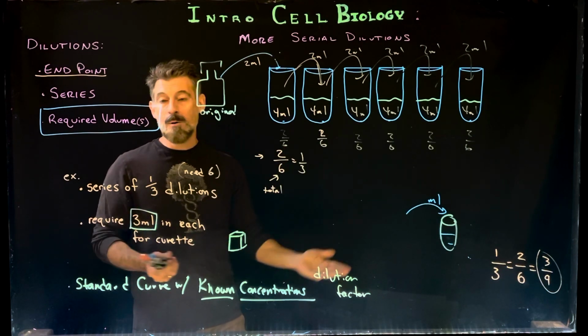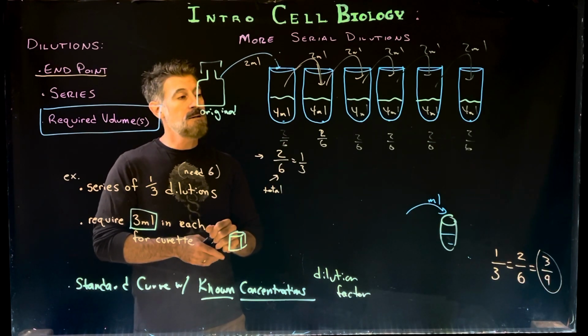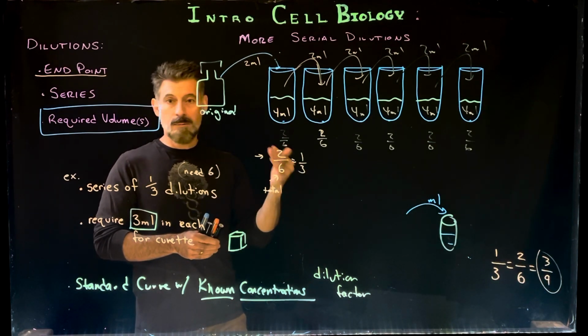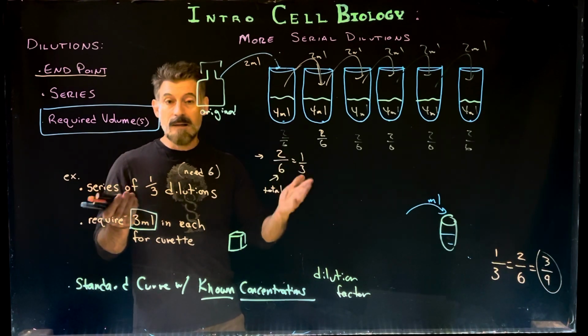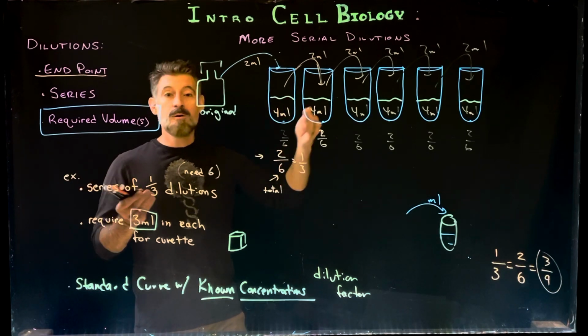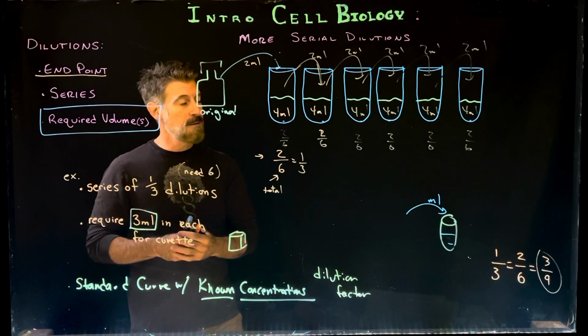And as we do pipetting in lab, we could measure these smaller volumes using pipetters a little bit easier than larger ones. They could be a little more accurate. But it doesn't really matter as long as you meet your goal. And so you have to know what the goal is and then work back, like I said, from that.